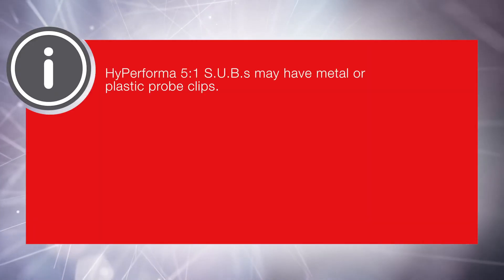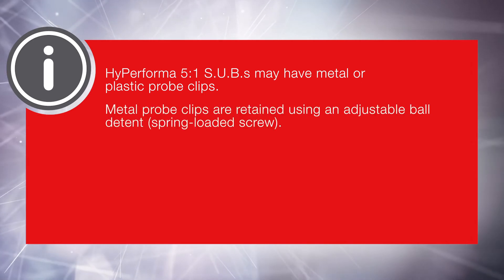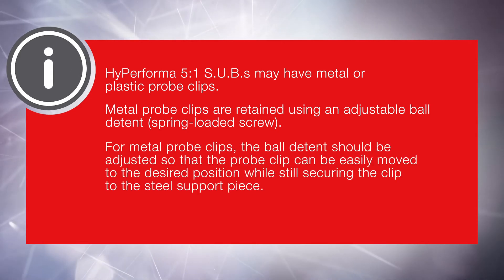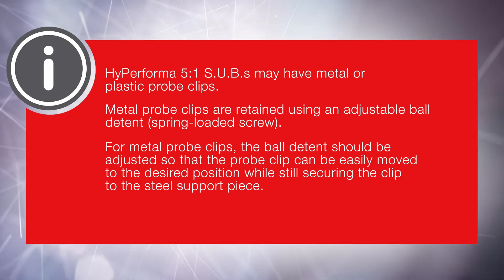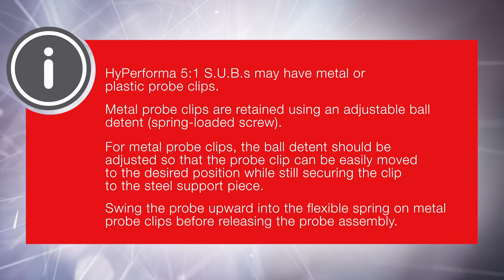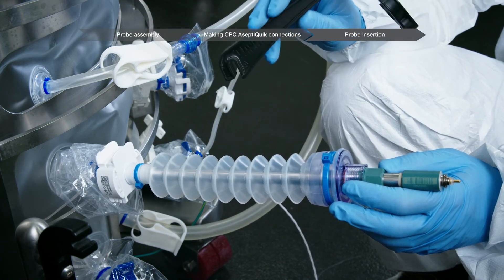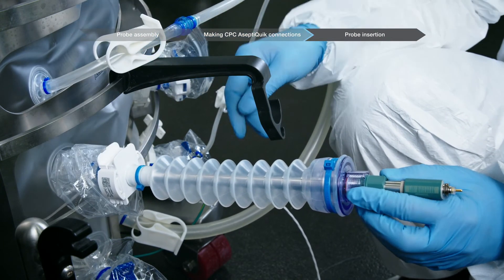Hyperforma 5-to-1 SUBs may have metal or plastic probe clips. Metal probe clips are retained using an adjustable ball detent spring-loaded screw. The ball detent should be adjusted so that the probe clip can be easily moved to the desired position while still securing the clip to the steel support piece. Swing the probe upward into the flexible spring on metal probe clips before releasing the probe assembly. Plastic probe clips attach onto the outer support container above the probe assembly and slide on with firm pressure.